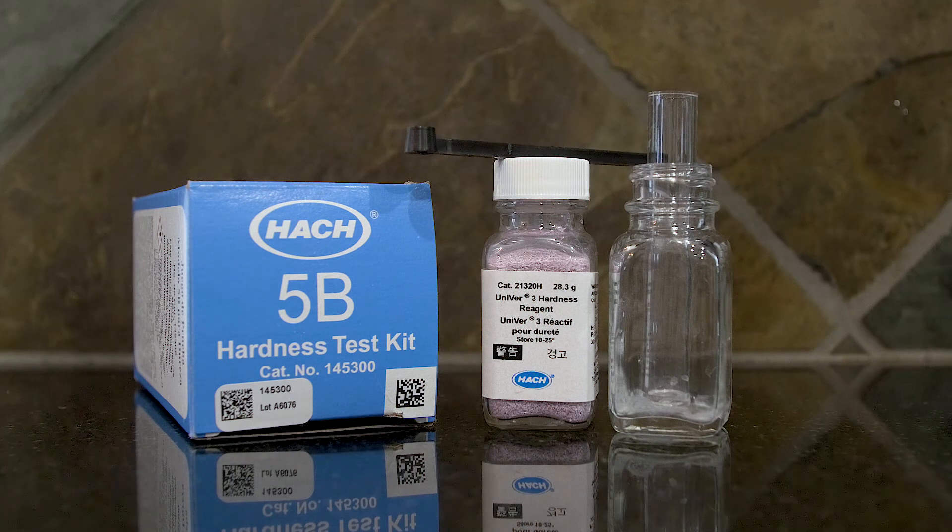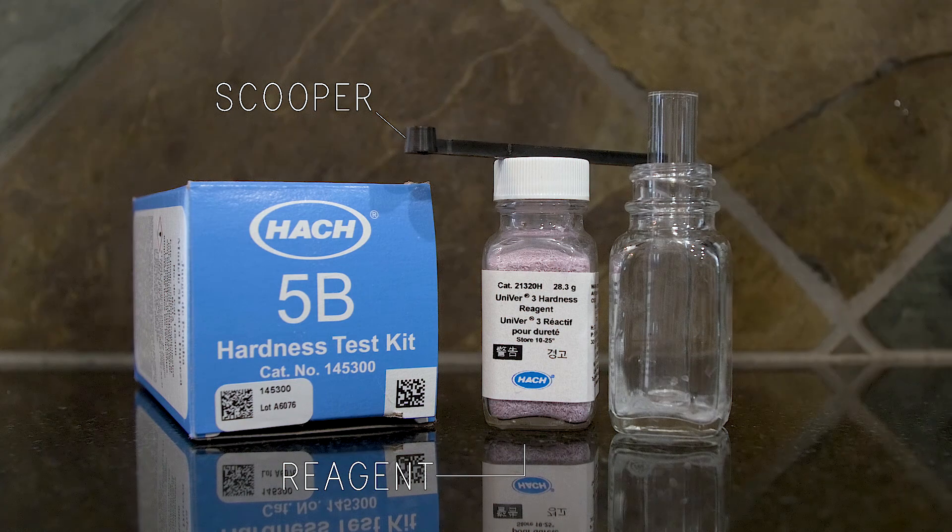As you can see here in the picture, we have our reagent, we have our scooper, we have a vial, and we have the canister in which we're going to mix the solution with the water.